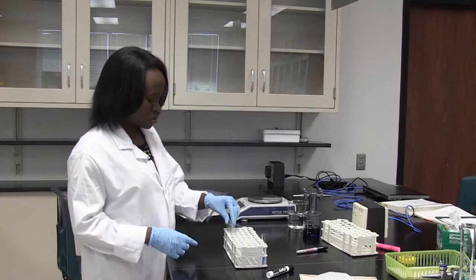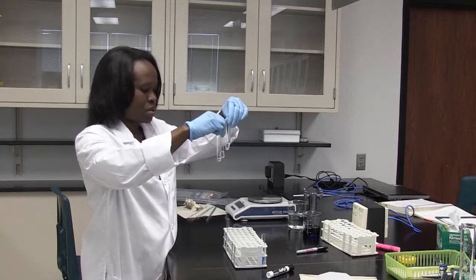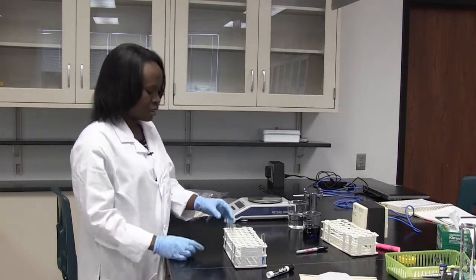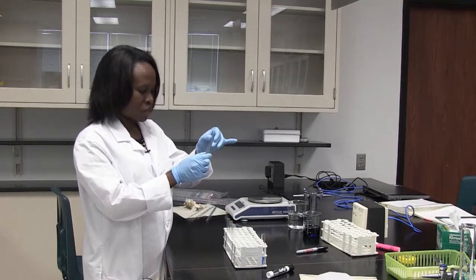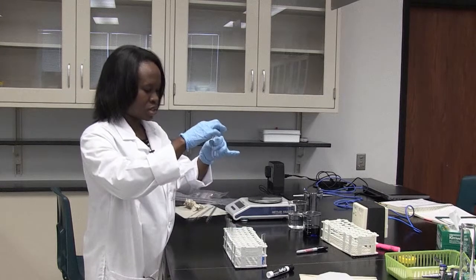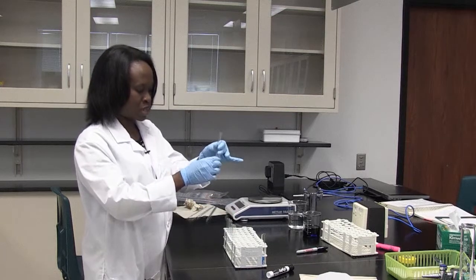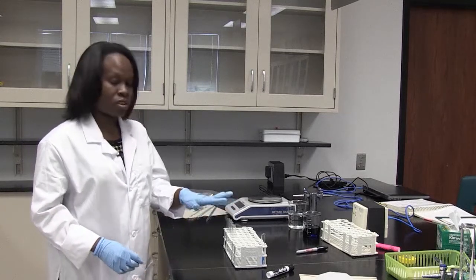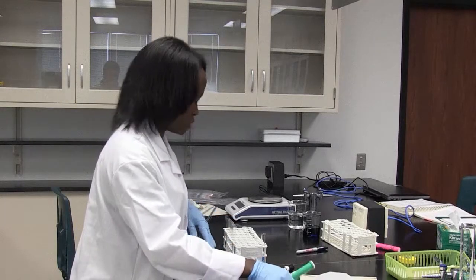So the first thing, of course, is to add water to your test tubes. Here, I added 2 mL of water to each of the test tubes. Then the idea is that first I take 1 mL of my stock solution and mix it into 2 mL of water in the first test tube. Then I take out 1 mL and put it into the next test tube and mix. I do the same thing, taking 1 mL from the last test tube and putting it into this one, and I continue until I have done 1-in-3 dilutions in every single step. So that is how you would do a 1-in-3 or a 3-fold serial dilution.